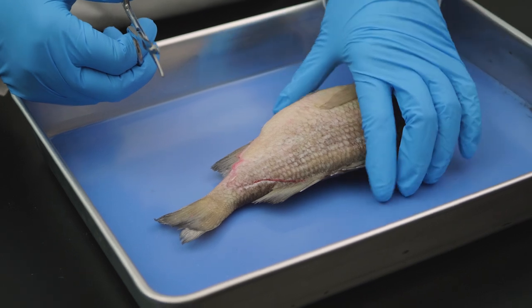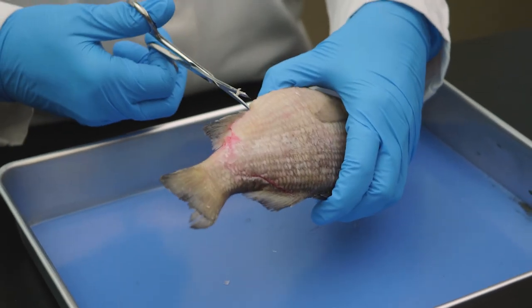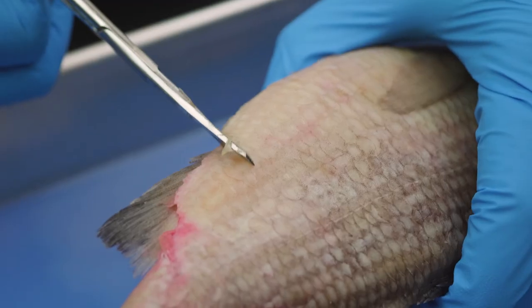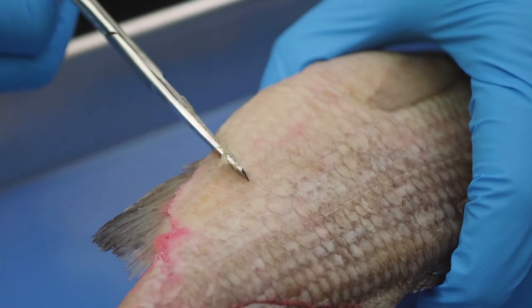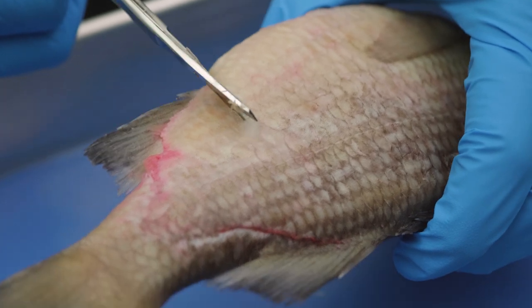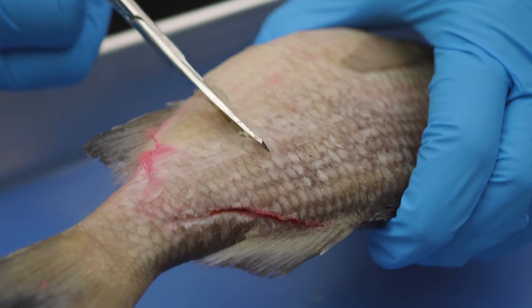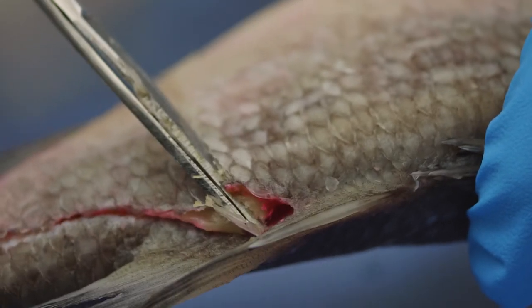Now we make a transverse cut from the anal fin up to the posterior dorsal fin. The ribs of the fish curve around the lateral side of the fish, so we need to cut through them. However, the perch's bones are not extremely hard, so we can cut through them with the scissors.